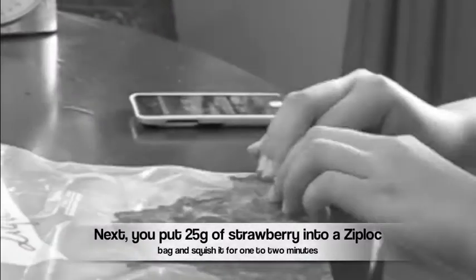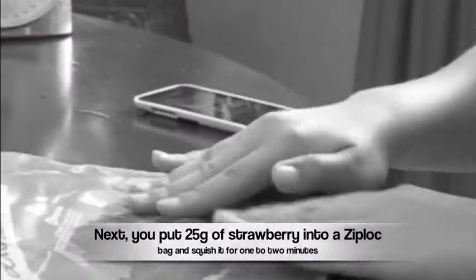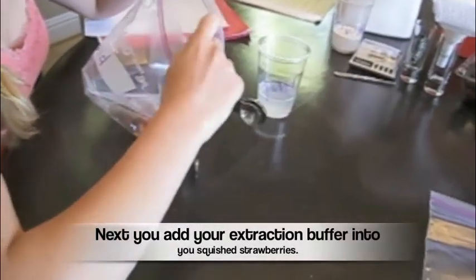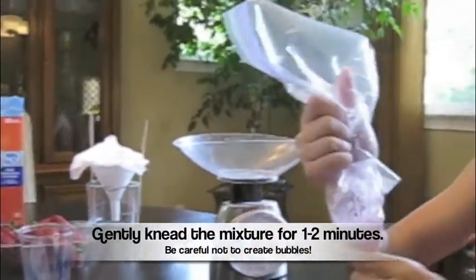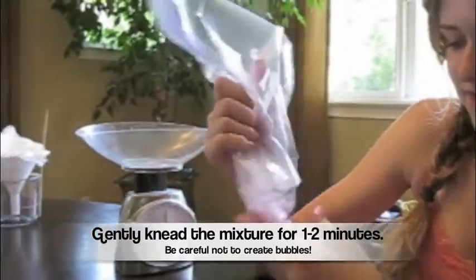First, you put 25 grams of strawberries into a plastic Ziploc bag. Then, after removing the air, you squish the bag for 1 to 2 minutes or until the strawberry is liquefied. Next, you add your extraction buffer into the bag with your strawberries. Next, you gently knead the mixture for 1 to 2 minutes. Try to create the least amount of bubbles as possible.